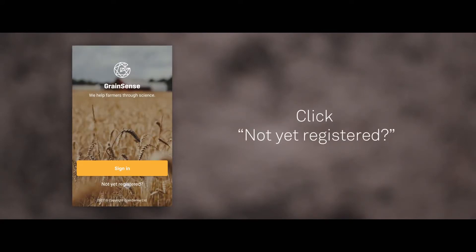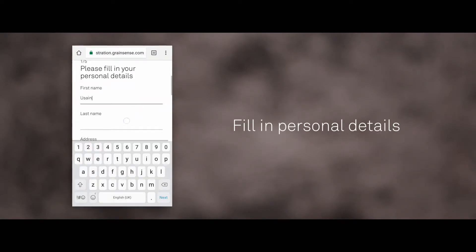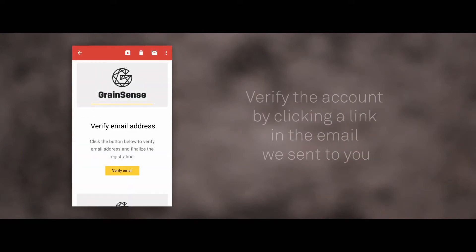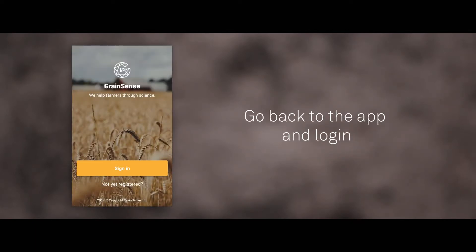Click Not Yet Registered. Fill in personal details. Verify the account by clicking a link in the email we sent to you. Go back to the app and log in.